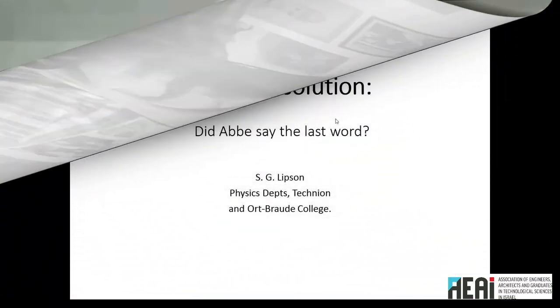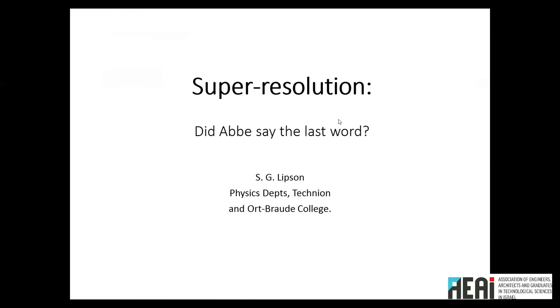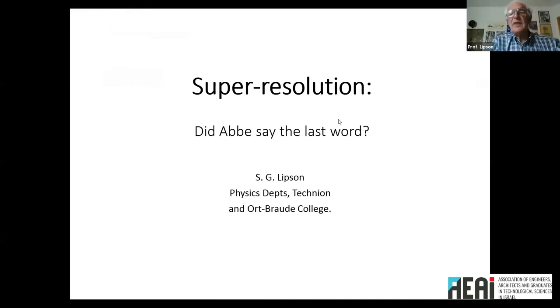Thank you. So can we see the presentation, please? Yes, okay. So good afternoon, everybody, if it is afternoon. And I'm going to take you on a tour of the topic of super resolution in microscopy. Super resolution also exists in other fields of optics, but we'll limit ourselves today to microscopy.